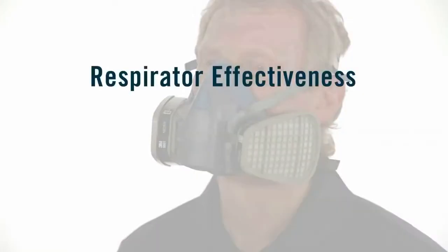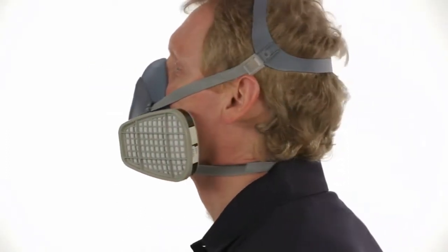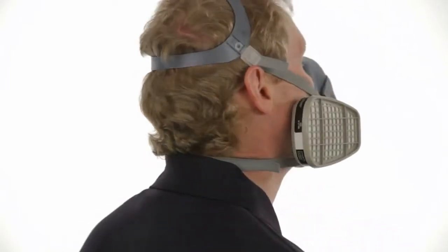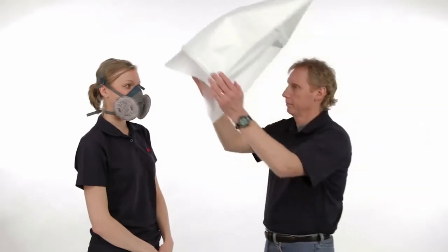The effectiveness of a respirator depends on its filter's efficiency in removing contaminants and the ability of the wearer to achieve an appropriate fit. No respirator can be effective if it doesn't fit and seal properly to your face. It is critical that all edges of the respirator are flush against your face. If you have a beard or other facial hair or any other condition that interferes with the face seal, you cannot use the facepieces featured in this video. An additional segment demonstrates fit testing your respirator.